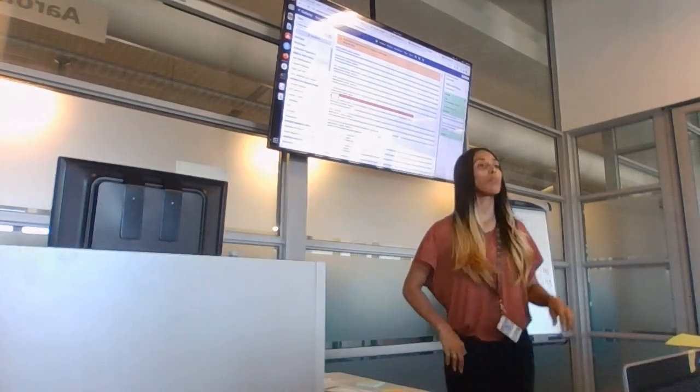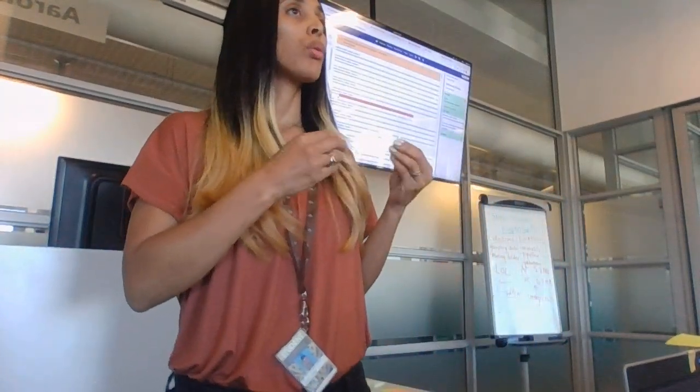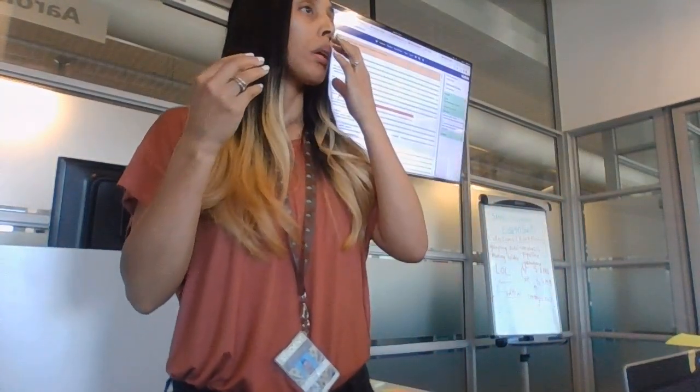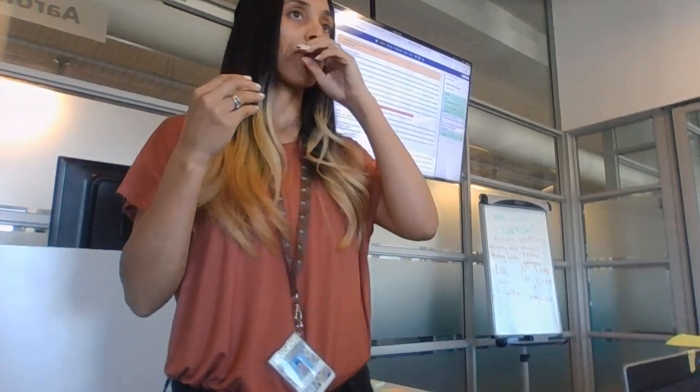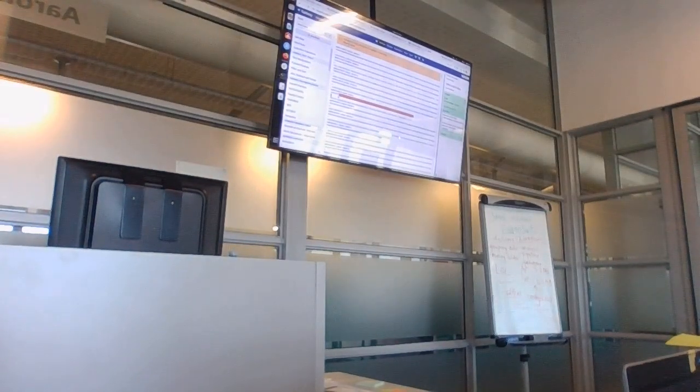But now you're talking about mutations. We are not talking about how it compares to an actual. No mutations. What I'm saying is more applicable to mutations when we're looking at short pieces that are missing. What I'm saying is, if you look at this as a reference file, right? My arm is a reference file.